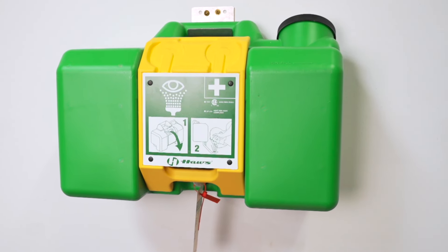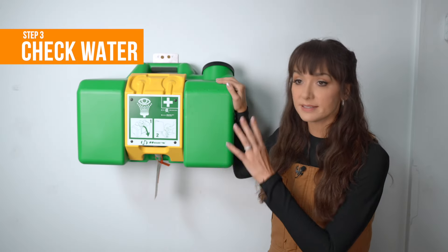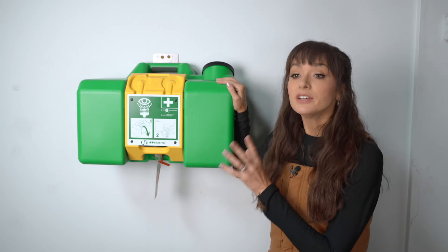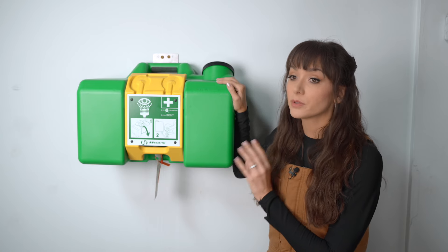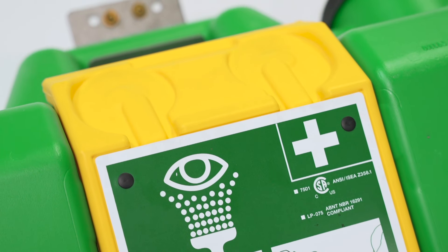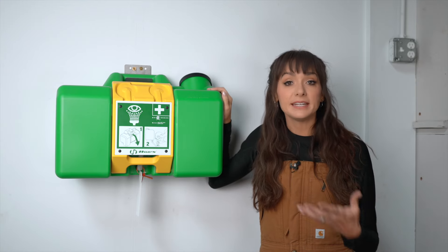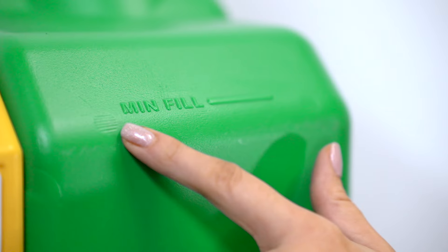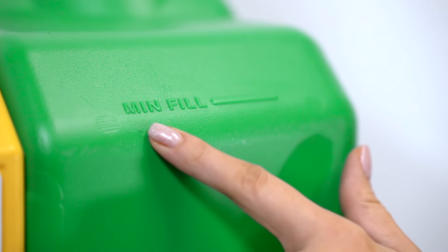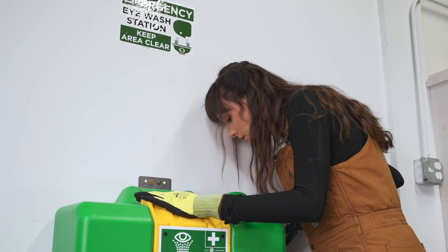Step 3: check the water. This particular station is filled with water, but some are filled with solutions. Solutions can actually expire, so if you have a solution, you want to check the expiration date. Visually check self-contained units weekly to determine if flushing fluid or water needs to be changed or added to. For water, make sure that it's at the main fill line and that there are no contaminants in the water.